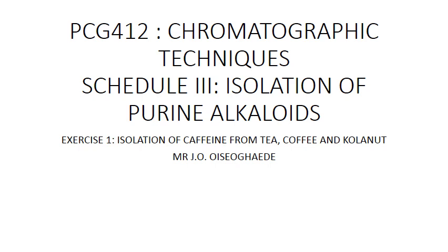In our series of PCG412 lab chromatographic techniques, today we'll be studying isolation of purine alkaloids. Exercise 1, isolation of caffeine from tea, coffee and kola nuts.